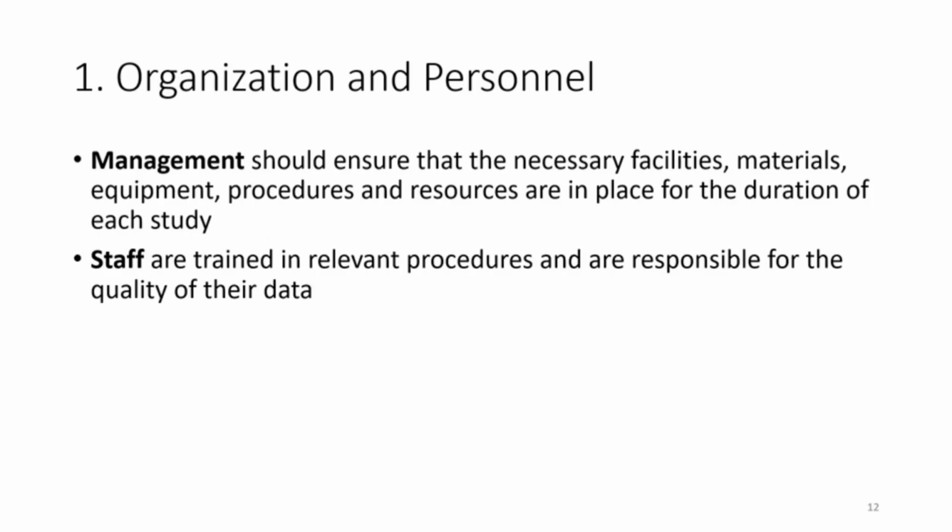And for staff, they should be trained in the relevant procedures and should be responsible for the quality of the data because they are the ones who will be doing the experiment and producing the data.